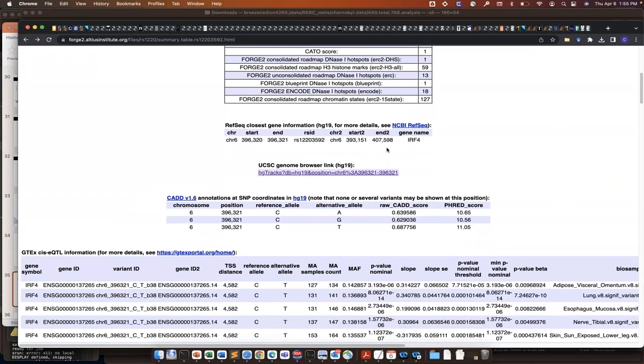Does the closest gene have a max distance allowance to the SNP? Right. On a chromosome, there will be a closest gene, because every chromosome has genes. There is currently no distance limit because we're trying to keep the closest gene at any level. But you should look at the browser. We provide the browser shots in part because we were scared that somebody would find the closest gene is like 3 megabases away.